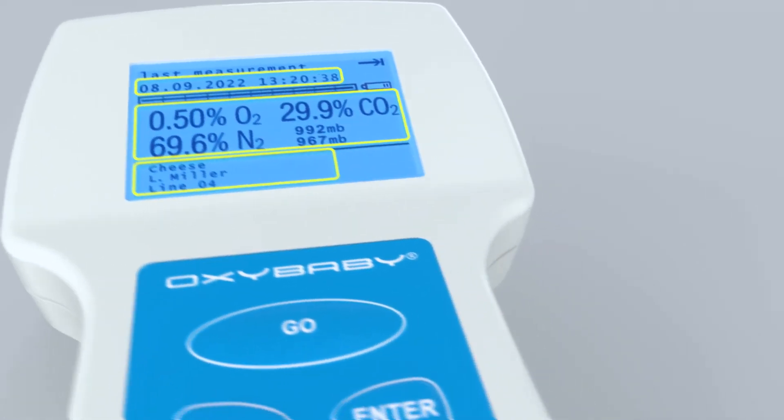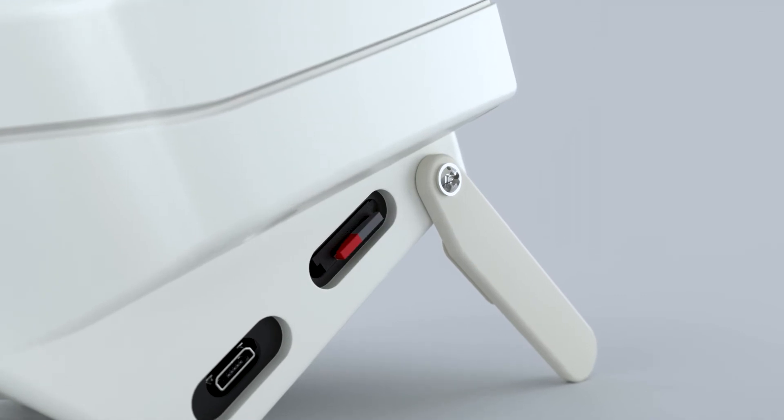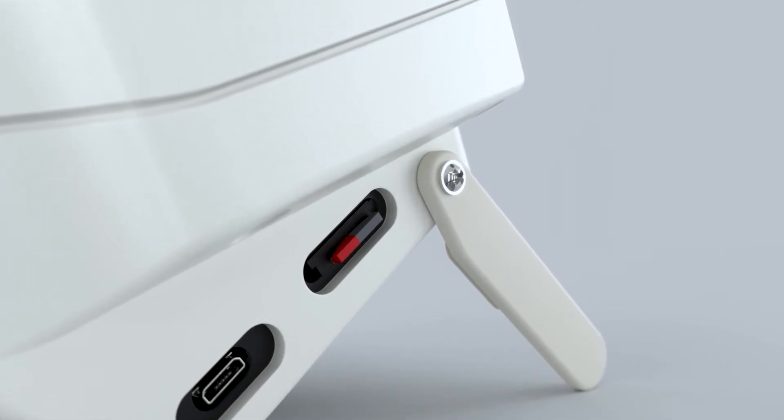The data can be exported as a CSV file on a micro SD card or even more conveniently with the special VIT software.